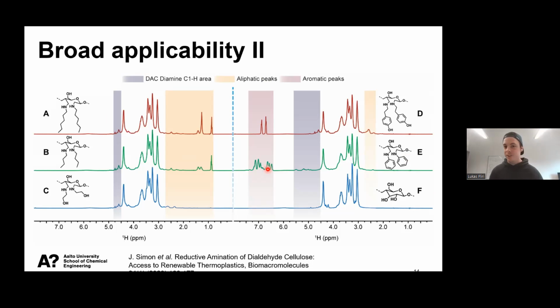It is very difficult normally to distinguish between these different materials. However, with solution state NMR, it became quite obvious, only in the diffusion edited experiment, which material belongs to which spectrum.